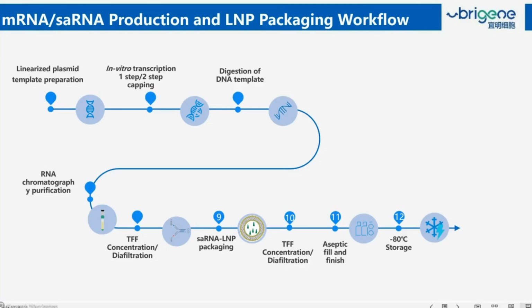These self-amplifying RNAs or mRNAs in the LNPs also have a straightforward, couple single step type purification where we can also fill and store.